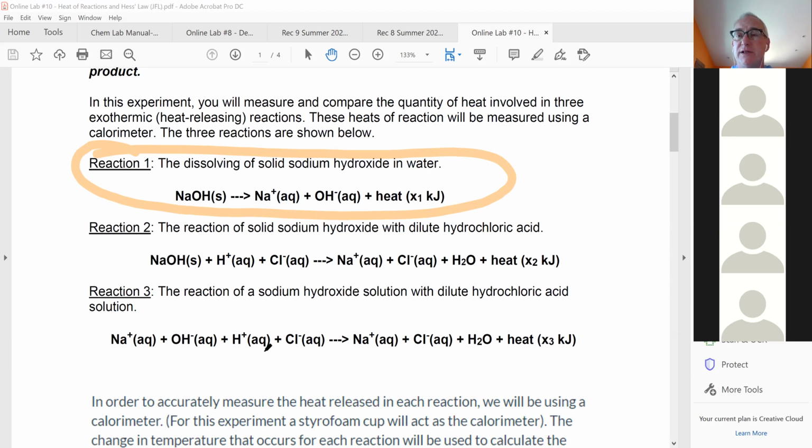The sugar doesn't really change. You're not breaking any bonds between the atoms in the sugar molecule. But what about sodium hydroxide? Are we actually breaking any bonds? Probably the sodium bonds. What sodium bonds? Sodium hydroxide bonds. What kind of bond is that? Heat is being released, so that could show that it's chemical. What kind of bond is it?